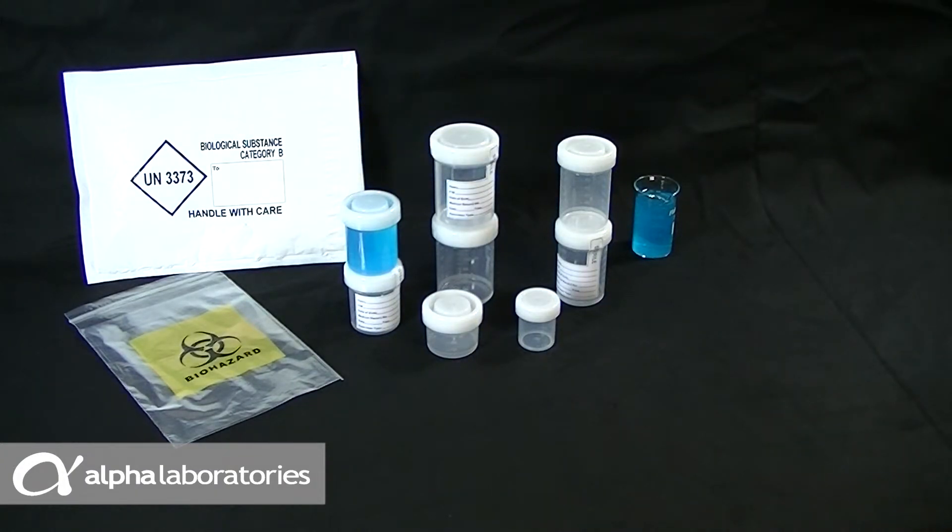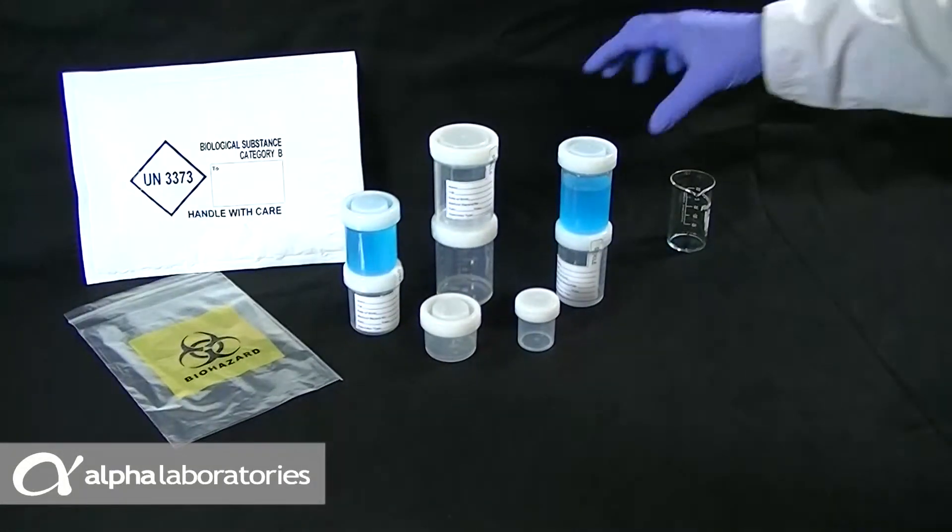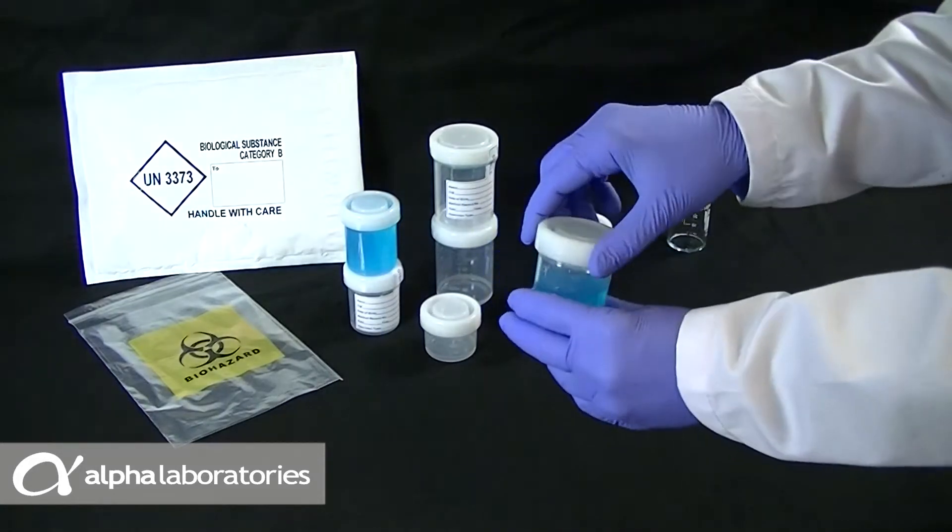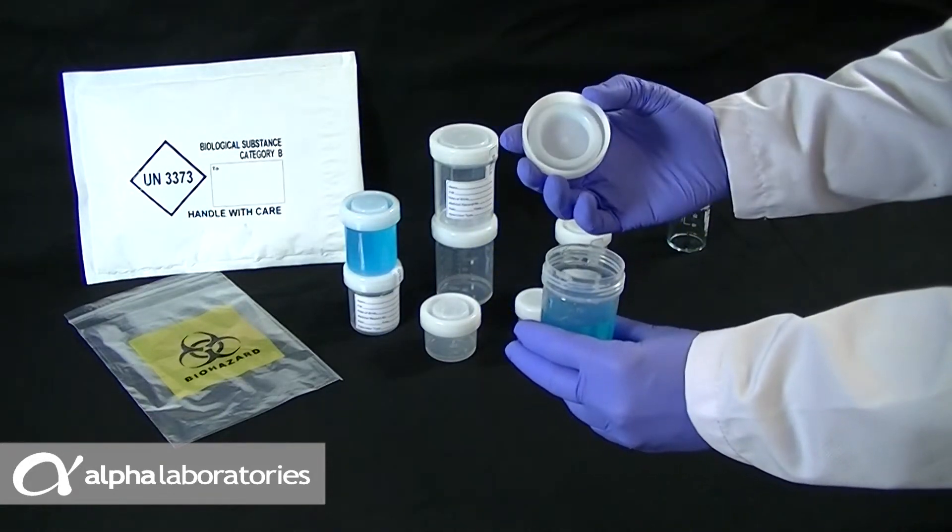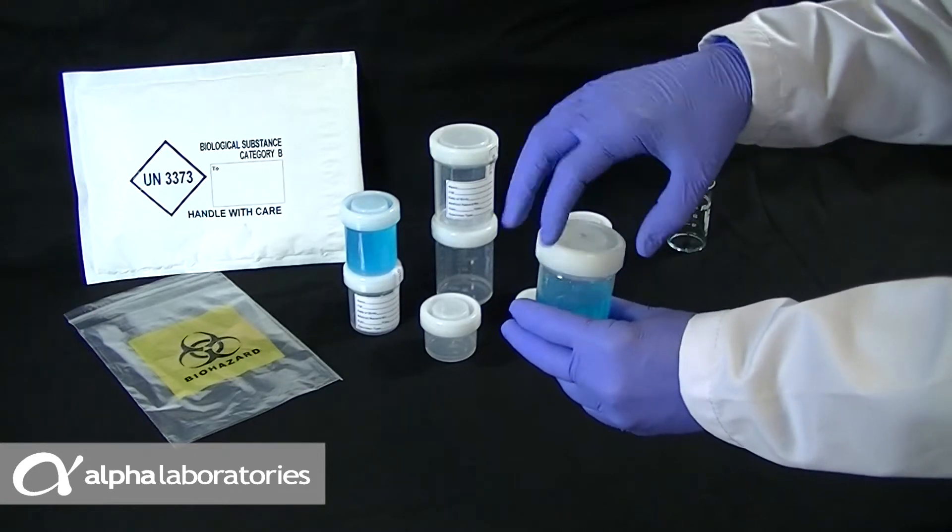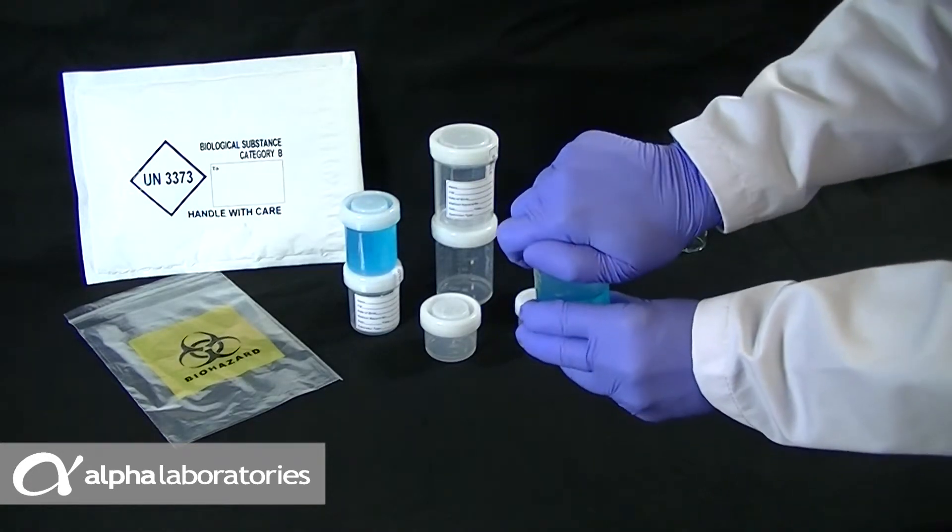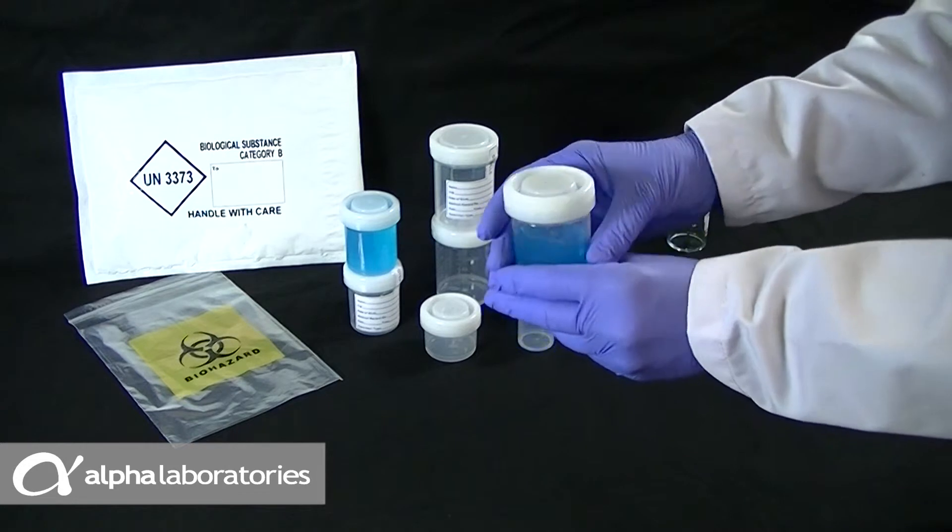The EasyGrip polypropylene cap and container ensure safe handling even when wearing gloves. The dual threaded superpositive seal fully engages in the last 12 degrees of turn to make them completely leak proof.